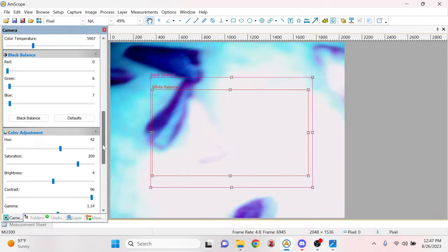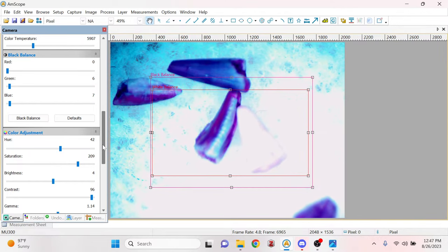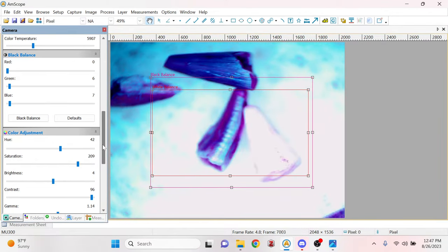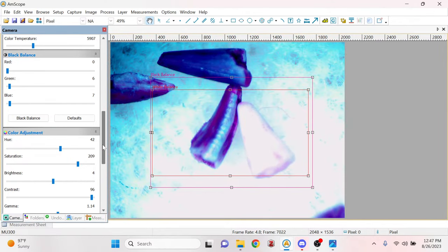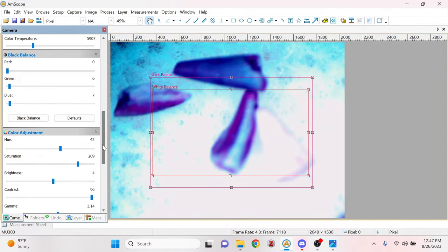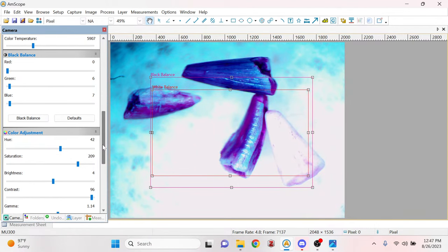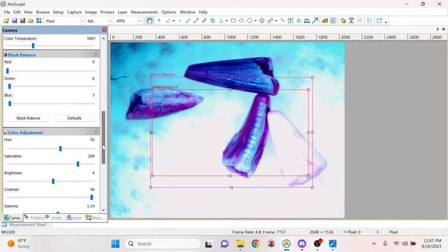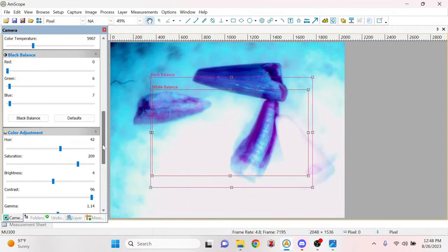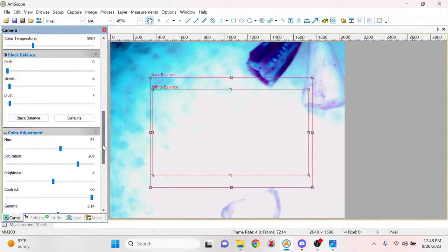I haven't ever streamed under this before. So what you're looking at, at the very top of my microscope, is a little tube where the camera attaches. And so I have to pull a lever that basically blinds the eyepieces, so it blocks out where you're supposed to use the eyepieces of the microscope. And instead, you've got the camera. The camera is streaming to a program called AmScope, and then OBS is broadcasting the AmScope to YouTube. So you are watching me manipulate fossils live from my little home studio, which is cool.